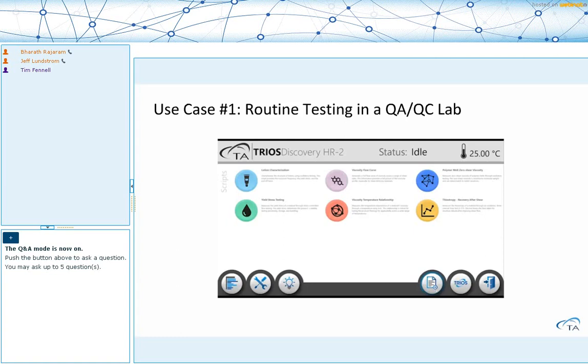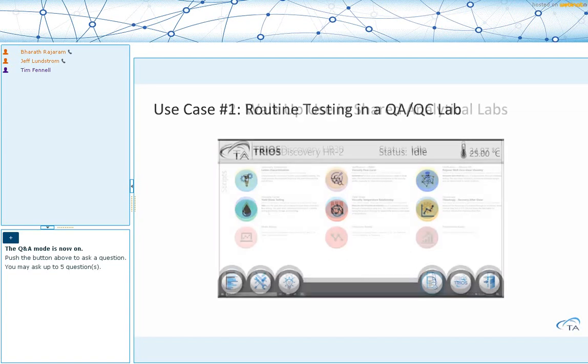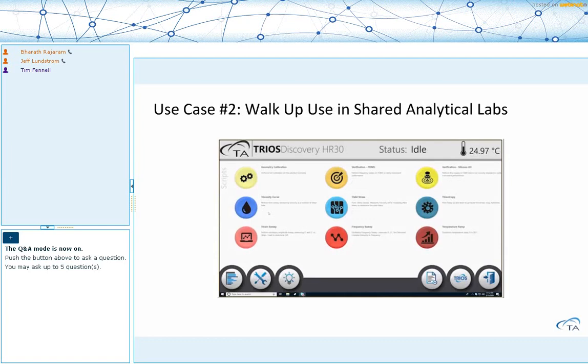So in this particular use case, we've shown how videos can be used for guiding users through sample loading and trimming, but the same concept can be extended to other aspects as well. For example, you can show them how to install a geometry. And at the end of this, once the test is complete, we will automatically do an analysis and bring them back to the one-touch view. So again, they started in the one-touch view. When they click OK, after cleaning the sample, that is where they will be brought back to guided operation with a simplified interface. And that is the goal of autopilot.